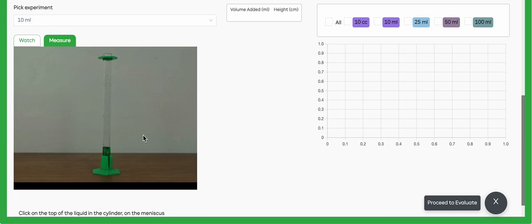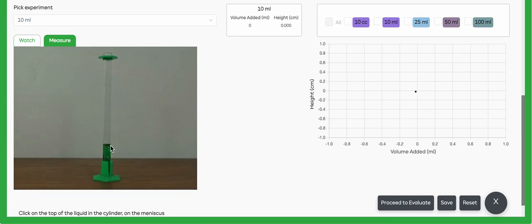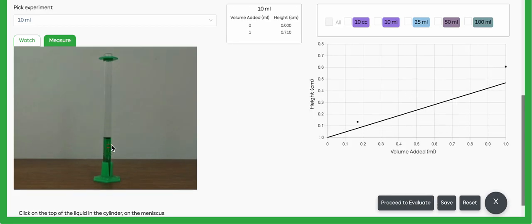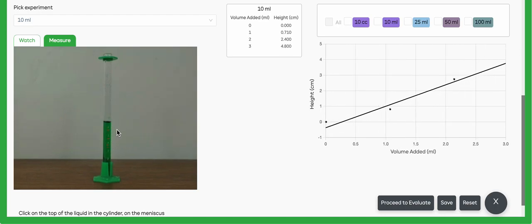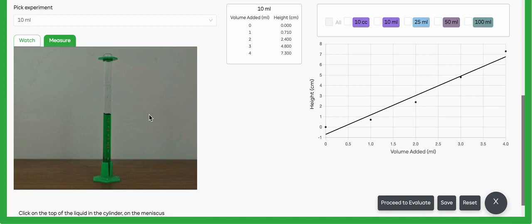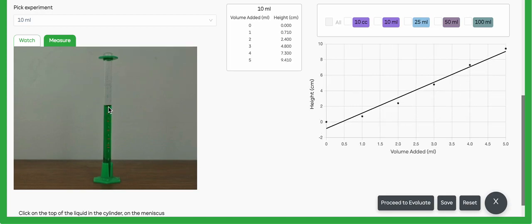We can go ahead and click to make measurements right where I mentioned, on that meniscus of the water. Do your best job. These clicks aren't going to be perfect because it is real data and we're measuring it from the Smart Science system where we have to click to make those measurements.